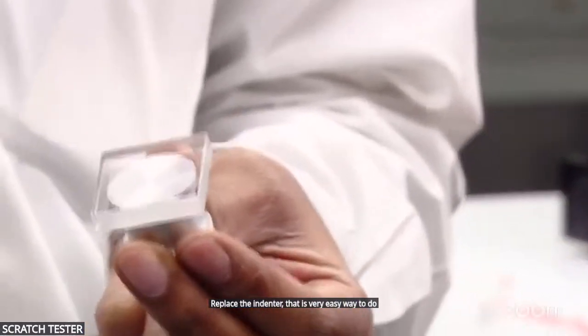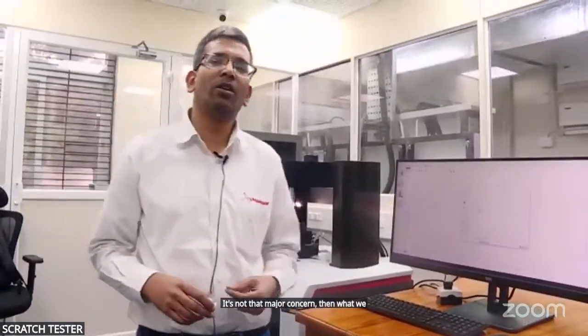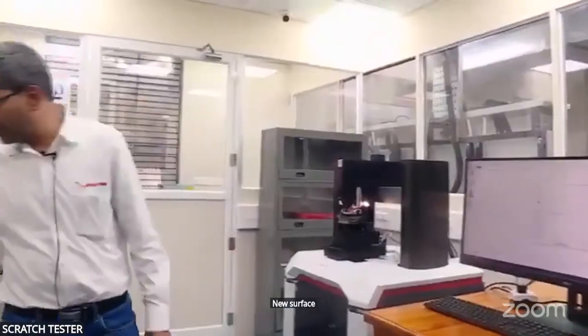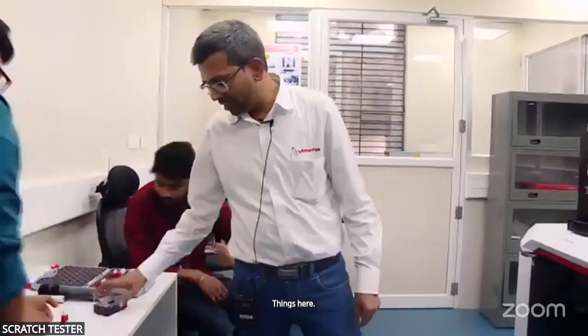Other is we can just take the indenter under the microscope and see it. And if I come to know it's not very off, it's slightly off, maybe it's not a major concern, then we can do a new indenter calibration so it gets set as per the new surface area. But those are a few of the important things in terms of indentation.